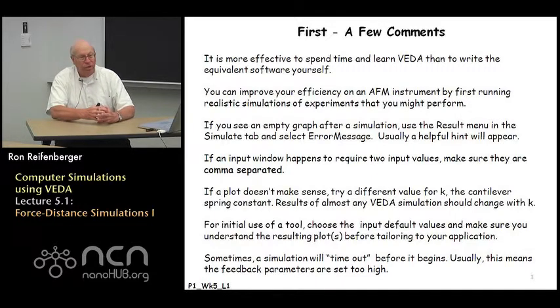Very often when you use VEDA for the first time, there's a wide variety of input parameters that you have to specify. My advice is the first time you use a particular application, just use the default parameters that are given in VEDA. These default parameters have been chosen to give you a reasonable plot. So rather than starting to tailor the input parameters to your particular application, make sure that you understand the plot that you get with the default parameters.